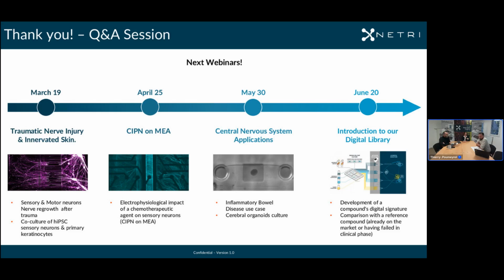And this is something we could happily work on with you, depending on whether it needs to be frozen and cryostat sections, or paraffin, or resin, and for higher magnification. Yeah, PDMS would not be an issue to cut. The only thing that could be an issue is if you are using the MEA plates. The material is a little bit harder, so we just have to make sure it doesn't bring any trouble. But for the regular PDMS ones, you should not have any issue with that.